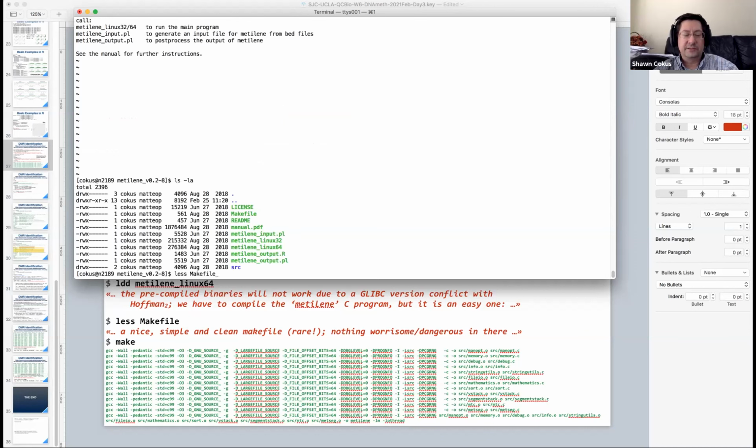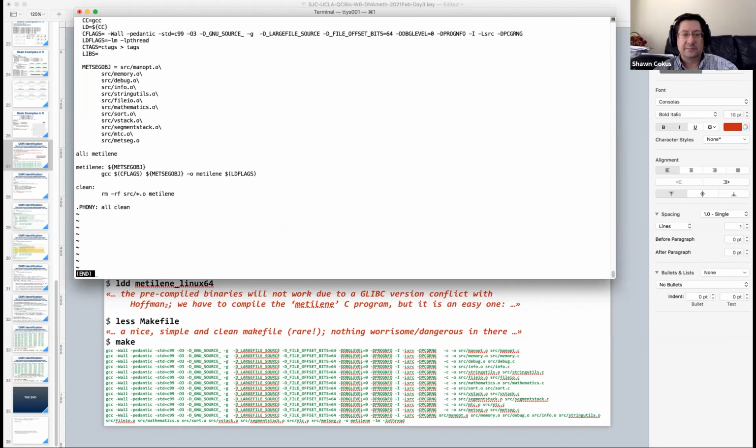Makefiles are another thing you shouldn't just run randomly. They are basically shell scripts, and they could contain rm -rfs that delete your whole file system. Who knows what? The question is, do they have parameters? What directories are they going to try to stuff things into?